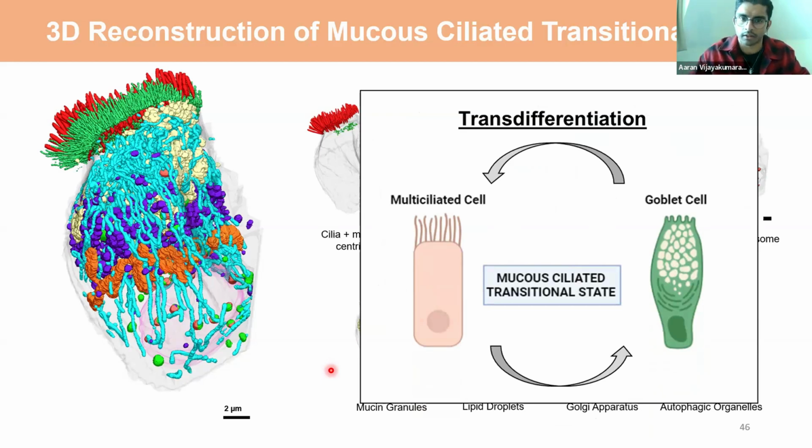And I think from a disease perspective, this is very interesting and is one that needs to be further interrogated and analyzed, and I hope those in the lab will. But it also shows how we can now expand volumetric EM with super resolution, with other assays, into the disease world to have a better understanding of disease and not just fundamental cell biology.